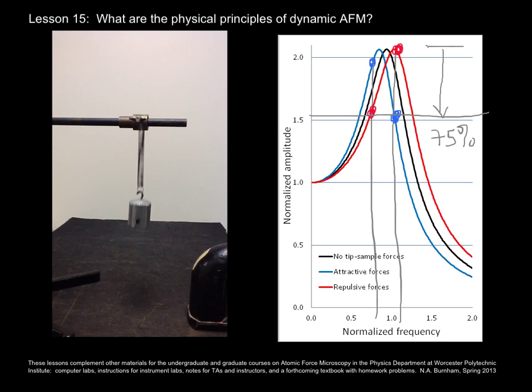Note that if you have chosen a drive frequency lower than the free resonance, that corresponds to repulsive interaction, and higher than the resonance corresponds to an attractive interaction.